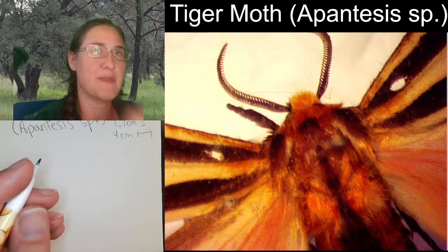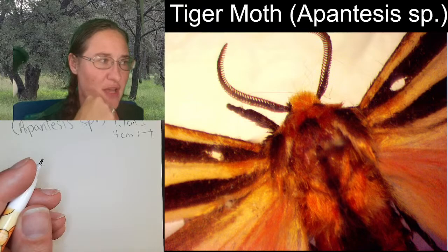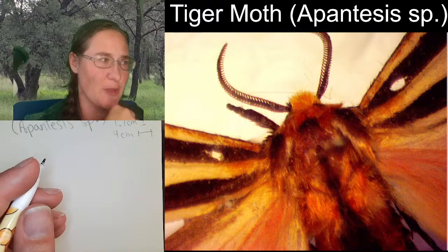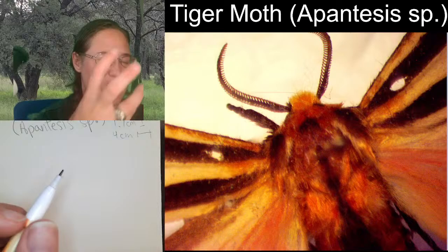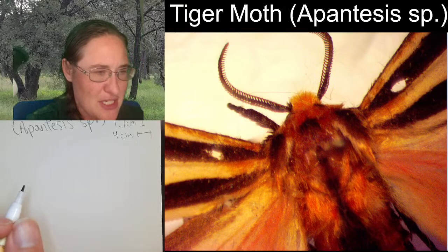These ones don't have the brush foot like nymphalids do. So all three pairs of legs are visible when they're walking around. And you're going to still have that first pair of legs moving forward and the second and third pair of legs moving backwards. I can understand the coxal segments are kind of long on this specimen, so I'll point it out to you in a little bit.